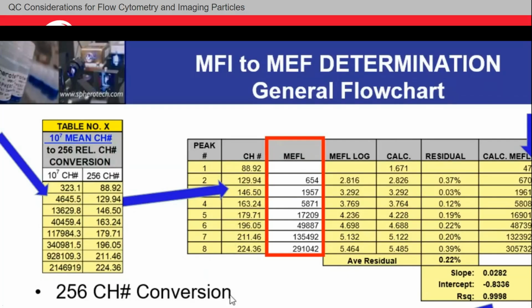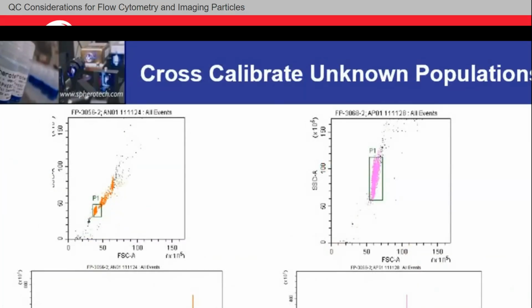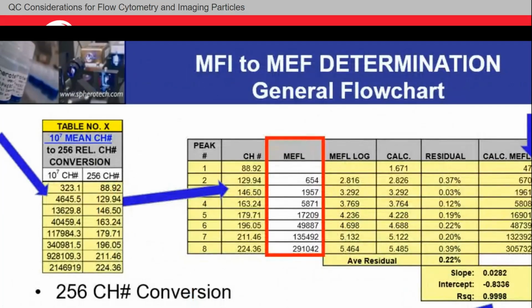Now, I've taken 2 different particle populations and I've gated them. And we're going to say, okay, it kind of looks like that 17237. Is that similar to 1354? Yes, they're on the same order of magnitude, right? So they are. And now we can say how statistically similar this MEF value is to this MEF value, because those are both the calculated ones that I'm running.